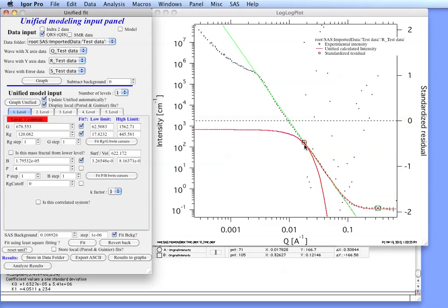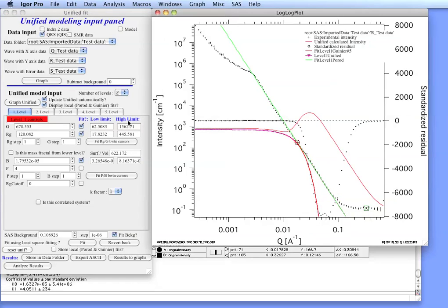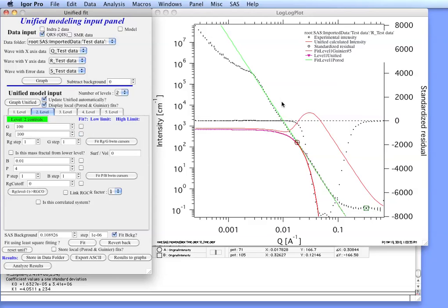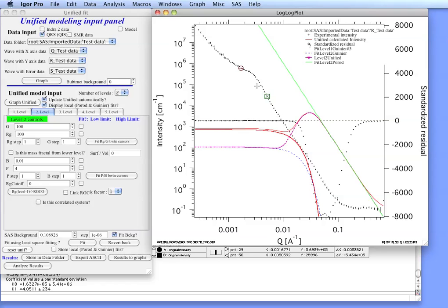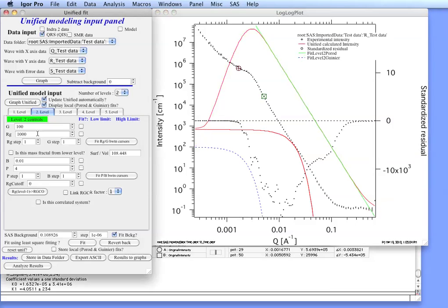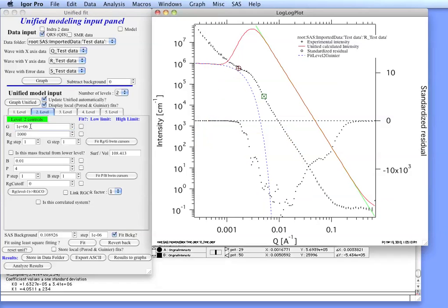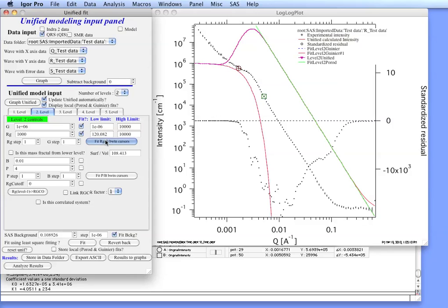Next what we need to do is we have to fit this Guinier area here. So for that we'll add a level number 2. And we click on level 2 here. Now what we can do is we can move the cursors up here to this Guinier area. And you can see that currently the Guinier is down here. Least squares fitting in this case would fail. So what we need to do is we need to add one zero to RG. And we need to add two zeros, four zeros to G. You can see that now we are much closer to the parameters. We can then select that we want to fit these two parameters. And then do fit.